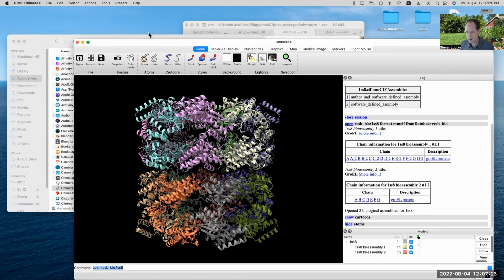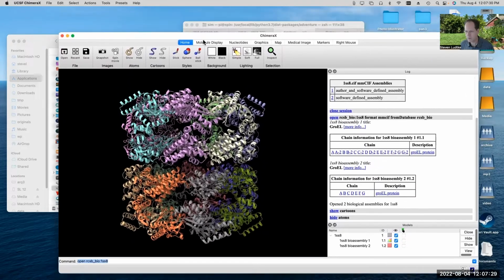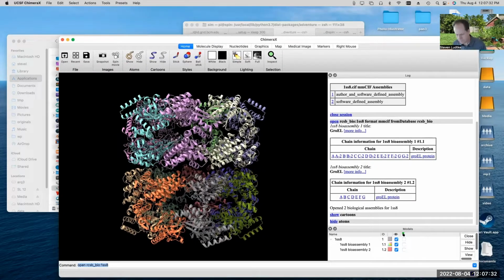So what I was thinking of doing is maybe taking one subunit and either shifting it or rotating it or something like that, and then maybe taking another subunit and either having it absent or present.